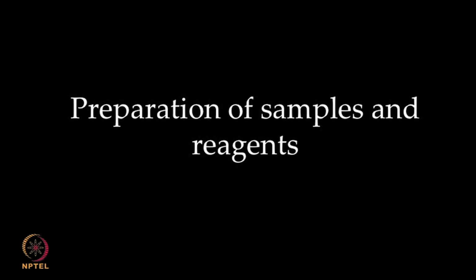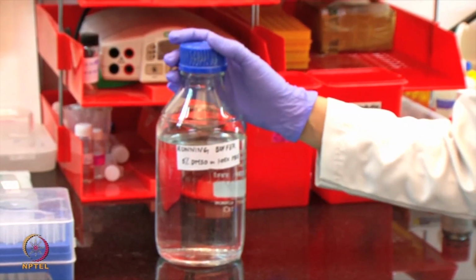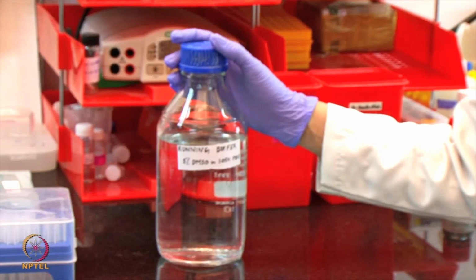We will now work on the reagents required for the kinetic assay to study the interaction between human serum albumin and furosemide. In this study, we will again be using 5% DMSO in 1.05x PBS as the running buffer, which will also be used for the initial startup cycle.